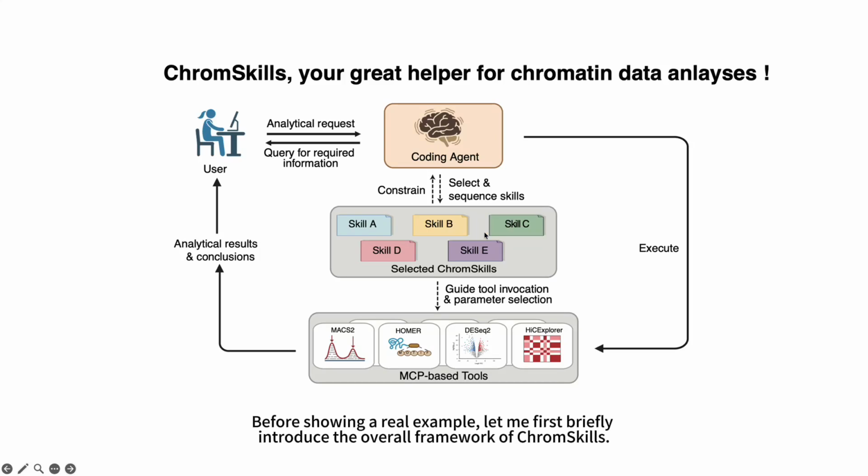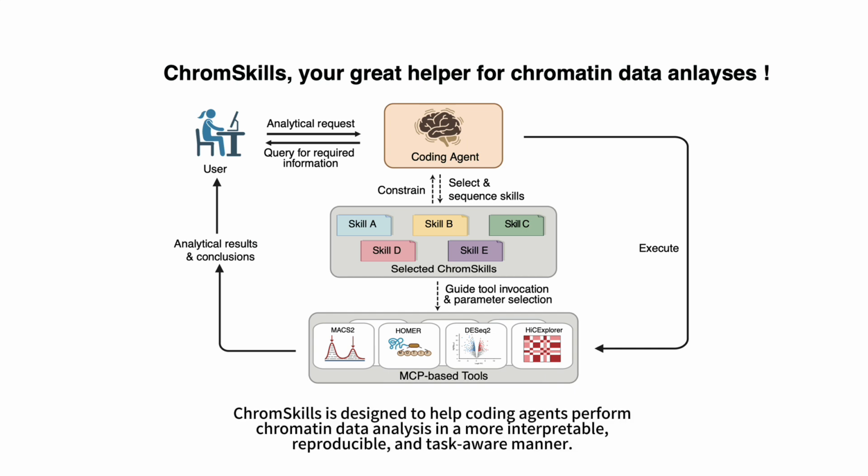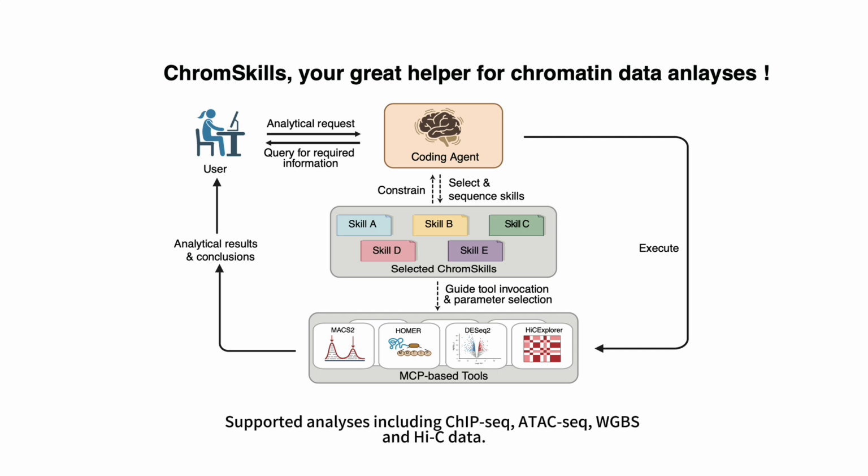Before showing a real example, let me first briefly introduce the overall framework of ChromSkills. ChromSkills is designed to help coding agents perform chromatin data analysis in a more interpretable, reproducible, and task-aware manner. Supported analyses include ChIP-seq, ATAC-seq, WGBS, and Hi-C data.